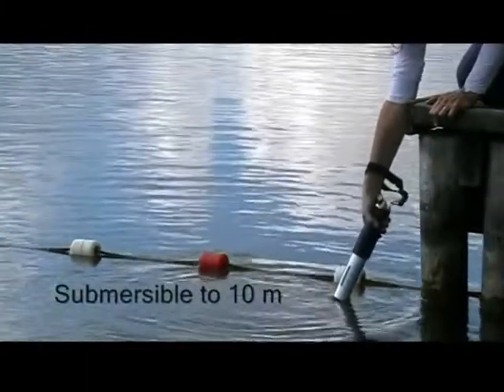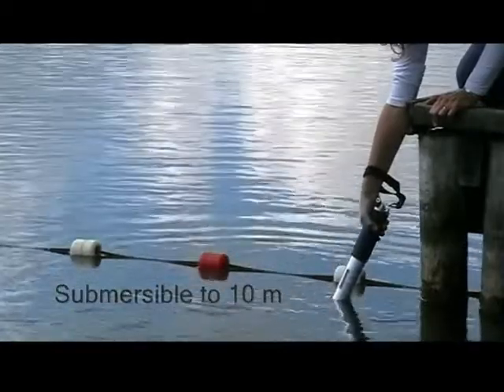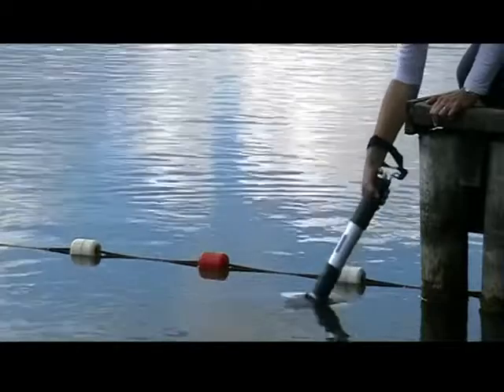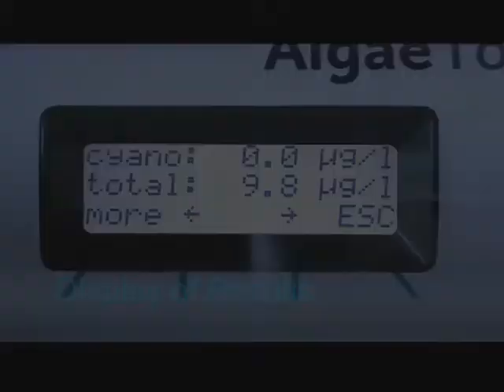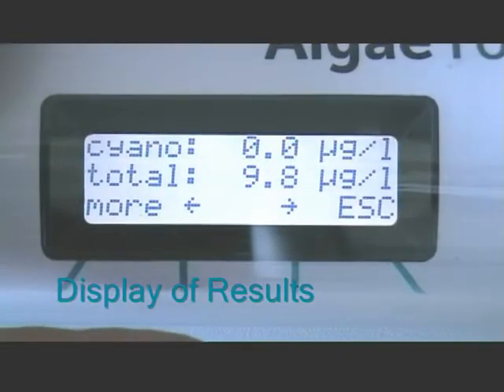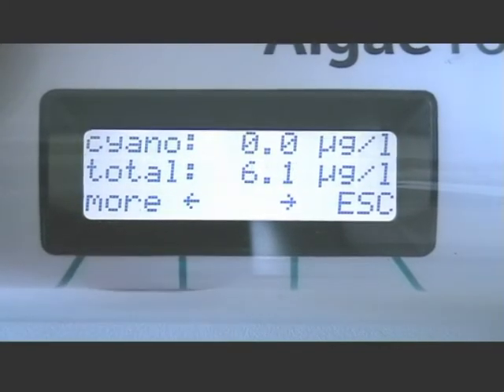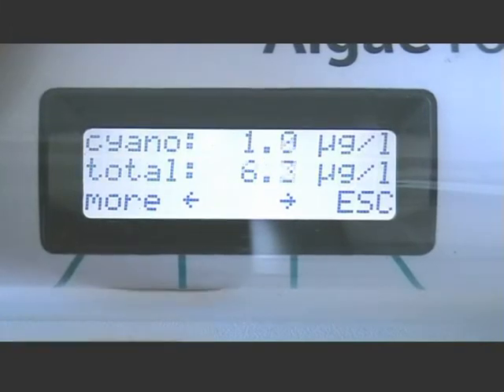The hand-held instrument is submerged down to a depth of 10 meters at the site to be measured. A 100 meter version is also available. The measurement results are shown immediately on the display. Additional results from previous measurements can be scrolled through by using the arrow keys. A turbidity measurement given in FTUs is also recorded.